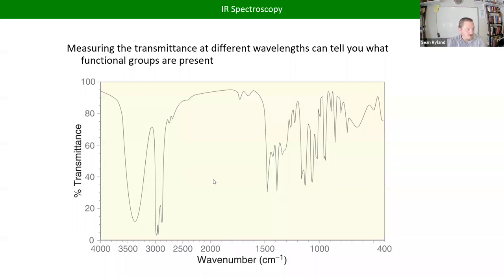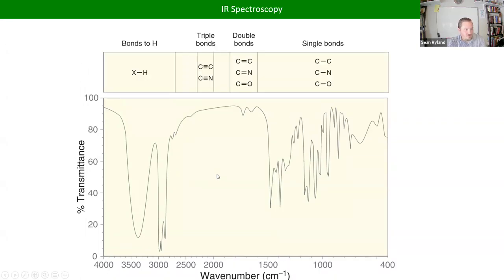And the way you do it, there are the most important groups I'm going to go over with you guys and give you an example of how we can read these. Because read is the wrong word. Interpret is the better word, because you're not reading this like it's a set thing that you know. It's like translating from another language and using the right idioms and stuff like that. It's more of an art sometimes.